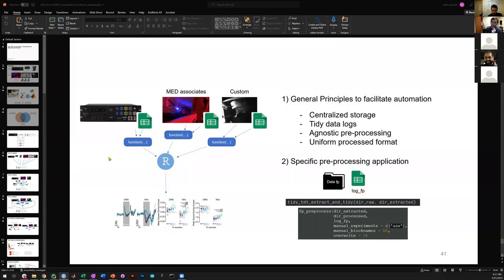Have you thought about compressing your video data? I know you do a lot of DeepLabCut, that kind of stuff. Is compressing it bad for it? With imaging it's tricky, because when you compress it, you lose information. We still store everything in H5 format, but that's not really compressing the data. I'll often use a Python script to convert TIFFs into JPEGs, and JPEGs are small enough to work with, but I don't try to compress beyond that.